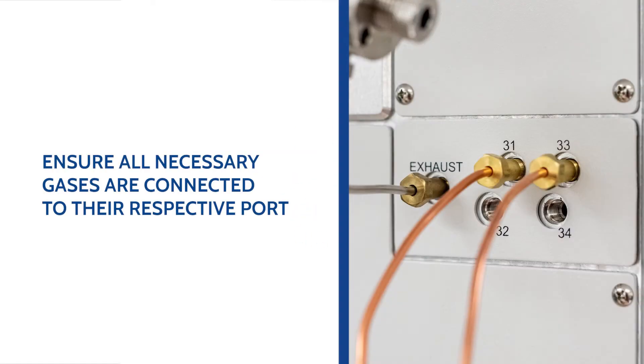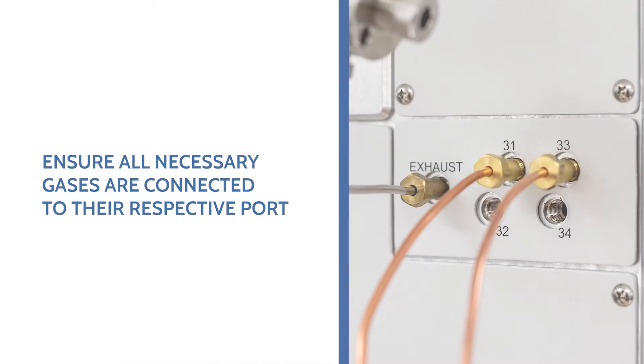Ensure to connect helium to a dynamic chemisorption gas port located on the left side of the instrument. Also ensure the exhaust is connected properly as shown here.